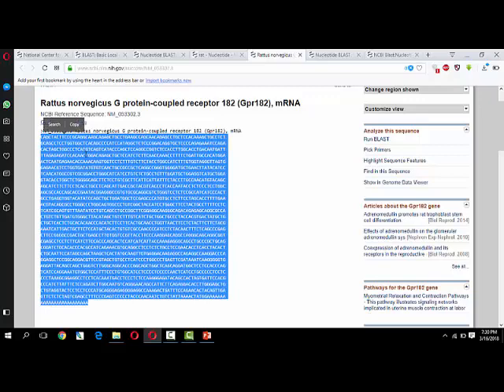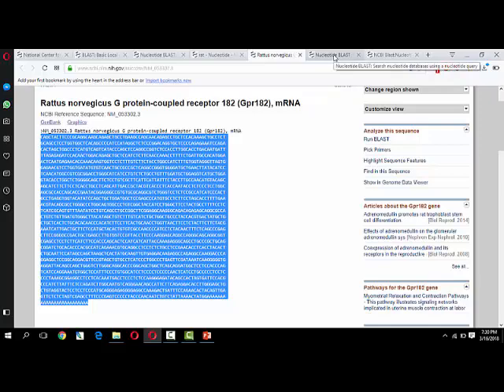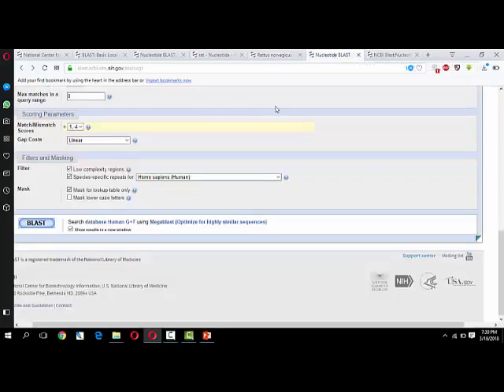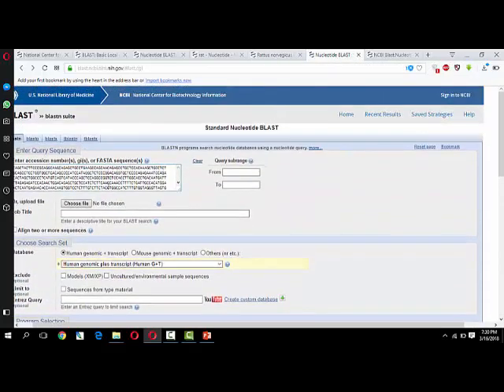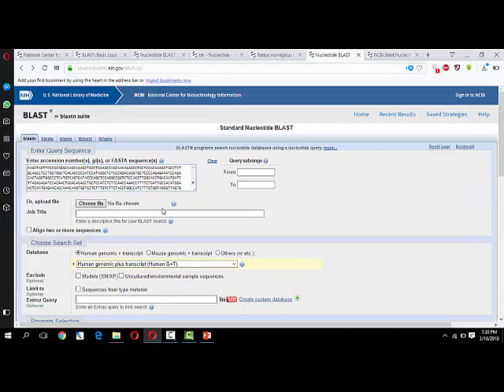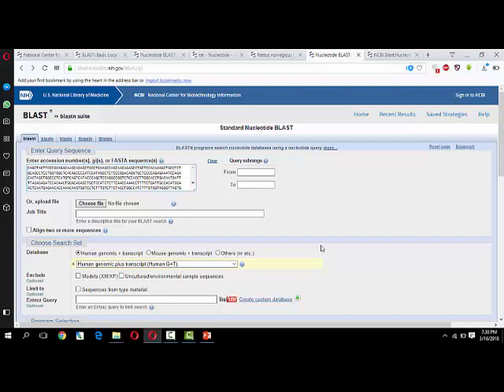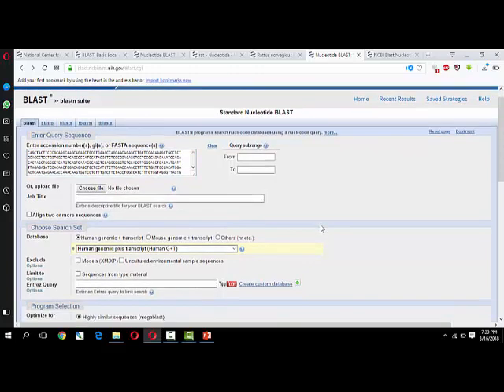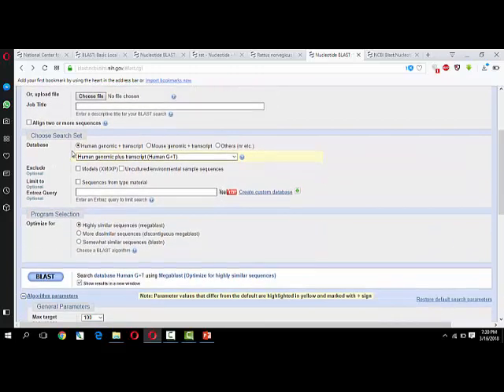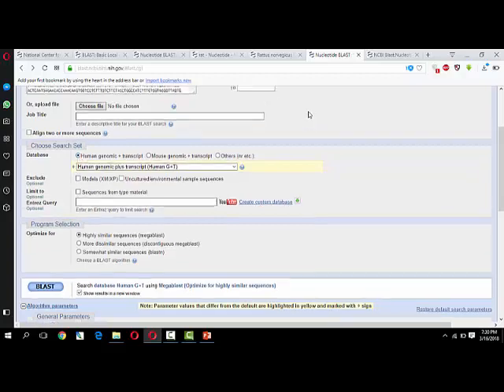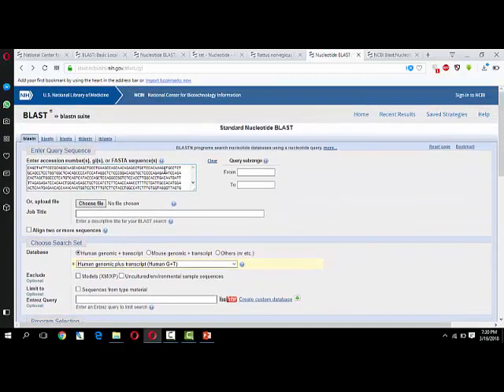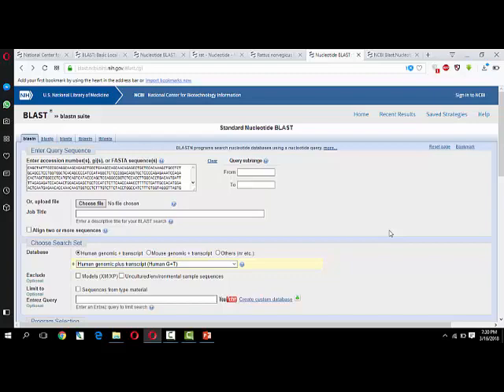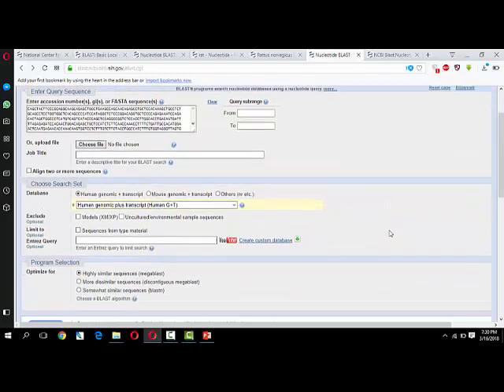I copied this sequence and pasted it in the nucleotide BLAST home page. You can see accession number or FASTA sequence is written here. I put my query in the form of FASTA format and I have selected human genome transcript. I want to see this rat gene similarity in human - its homology with human or similarity with human genetic material.